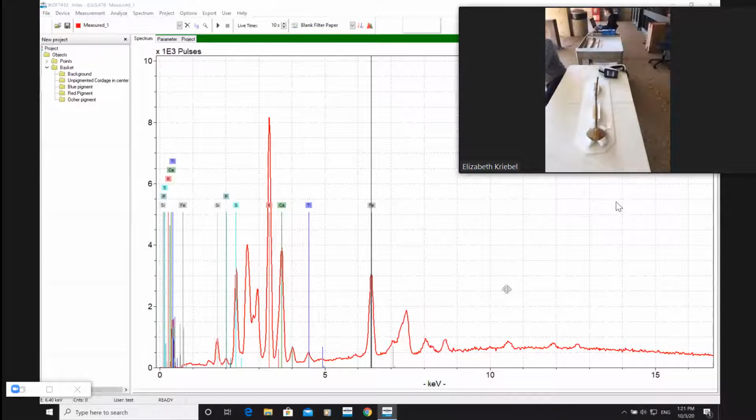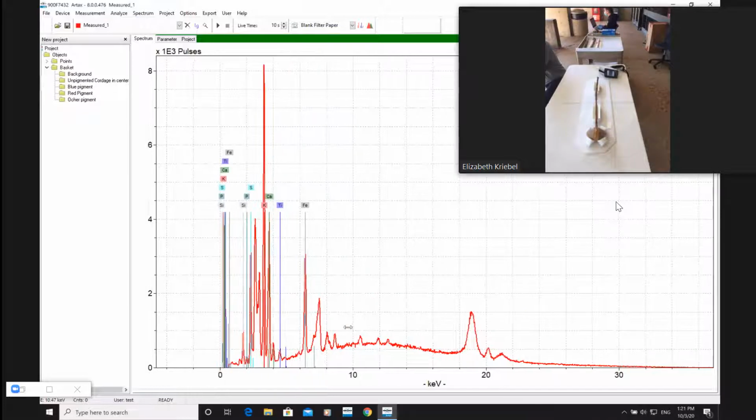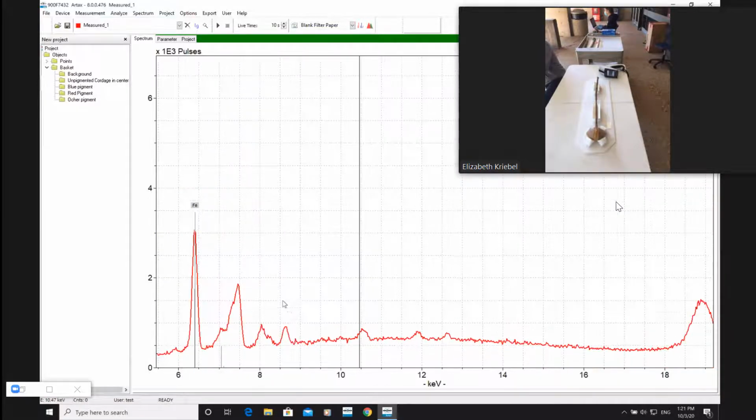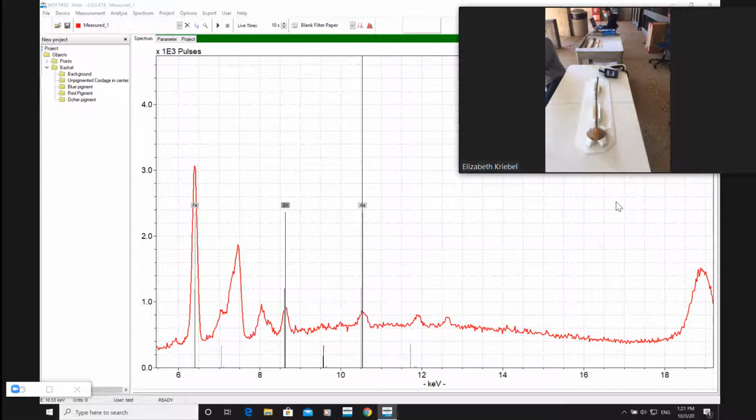Iron. And then out here, we've got some peaks too. So these peaks here, let's make this bigger. So over here, we have a little bit of zinc. Not too surprising. This is nickel right here. That's part of the X-ray tube. And I see, let's change the color. No, we don't have arsenic, but we do have lead. And, very interesting, we have bromine.